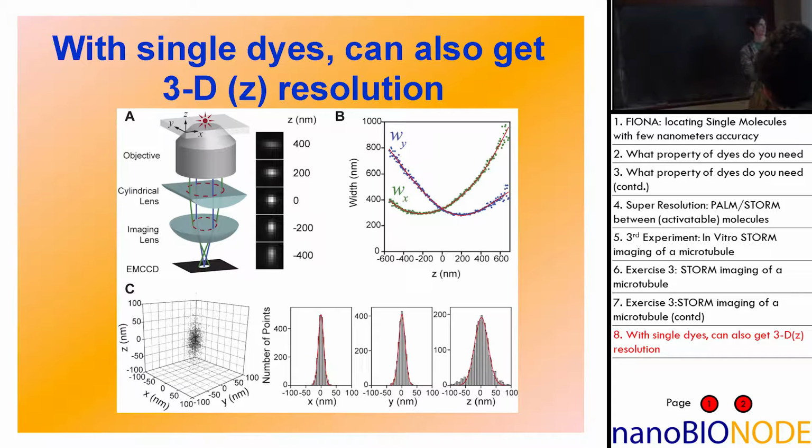For the in focus, so the 0 image, your full width at half maximum should be equal because it's a single photon coming in. It should have a symmetric point spread function. But as you do you agree?